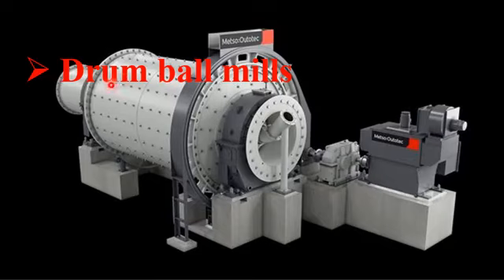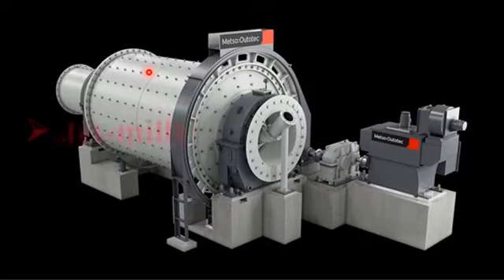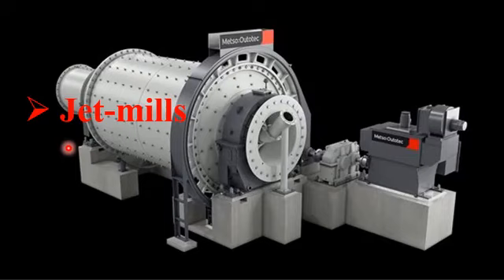Usually, dear student, please note that around 80 kg of bulk material is converted very easily at once using drum ball mills. Another type of milling machine used for the preparation of nanomaterials is known as the jet mill machine.